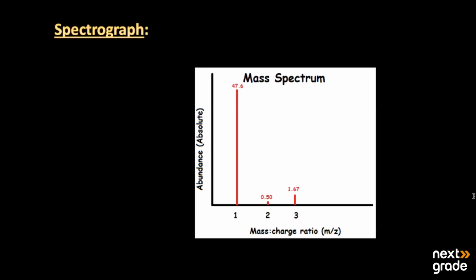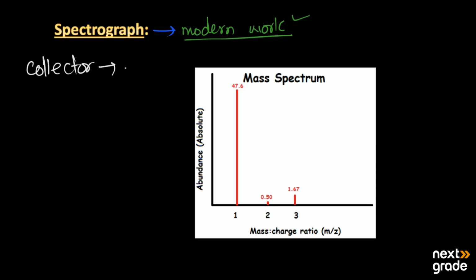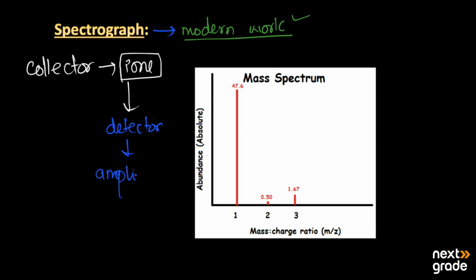This is the spectrograph. It works on the basis of modern work, in which the collector collects the ions, and then the detector amplifies the results.